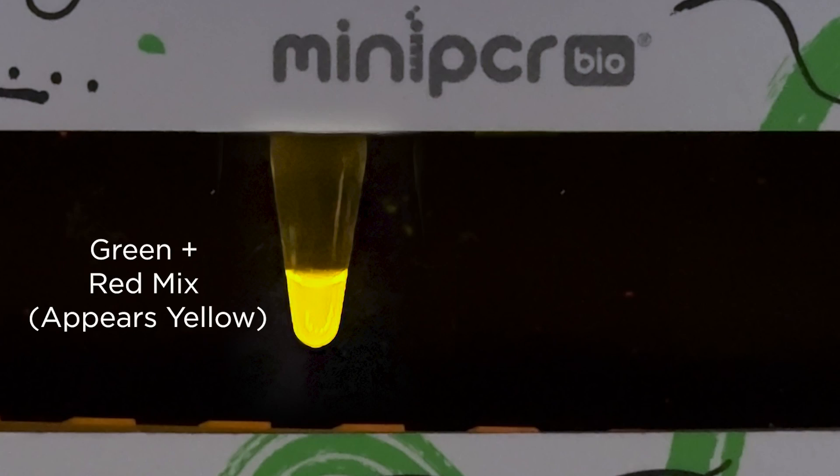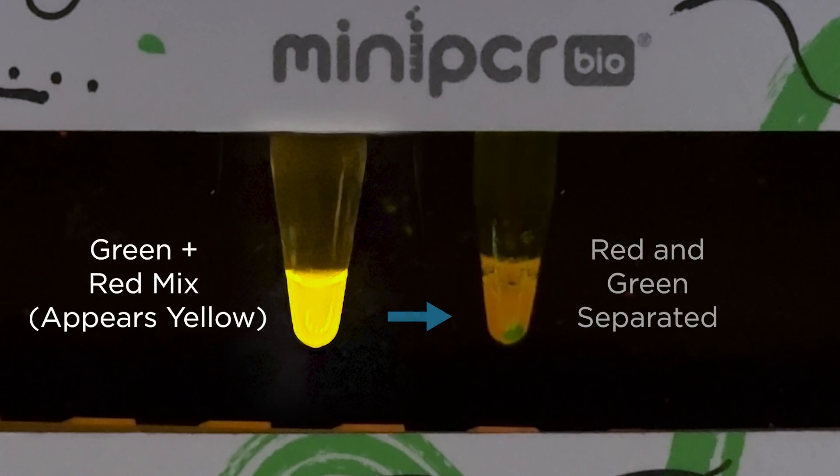Students will visually track the process via fluorescence as they allow the green protein to bind to the beads and separate the mixture on the magnetic rack. This classroom-friendly activity enables students to gain hands-on experience with protein expression and protein purification.